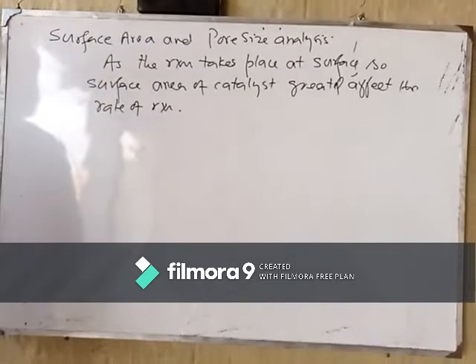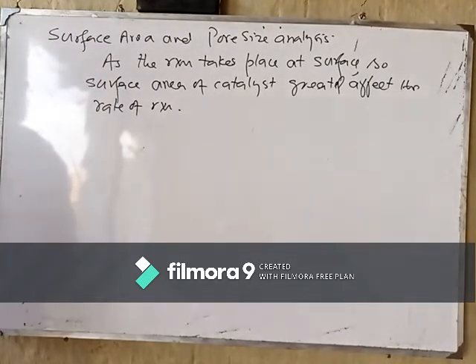Surface area is one of the factors that affect the catalytic reactions.